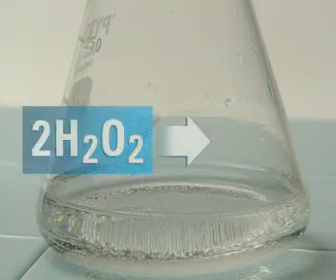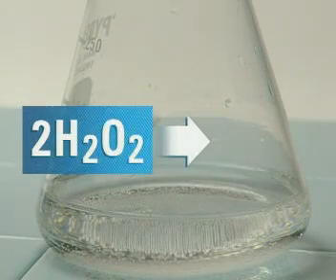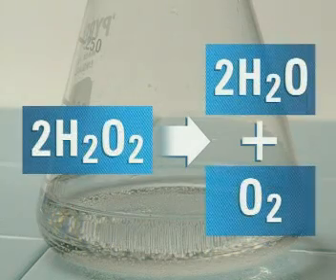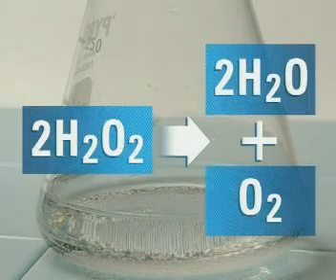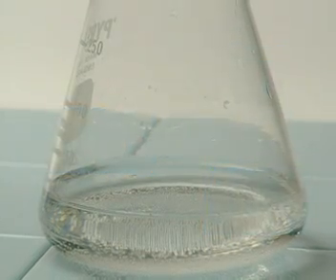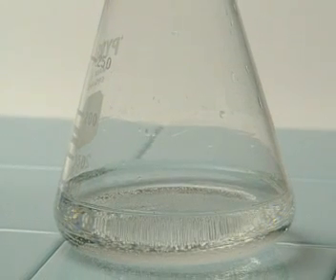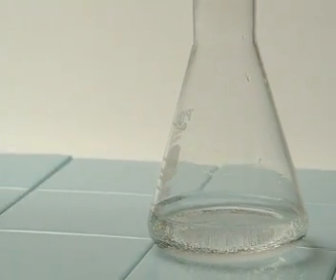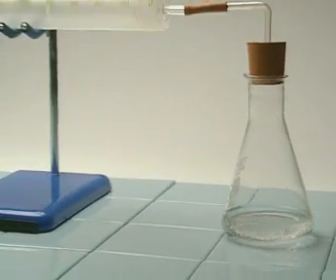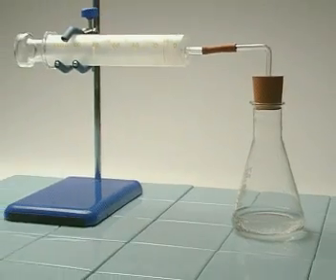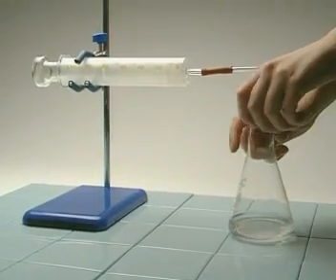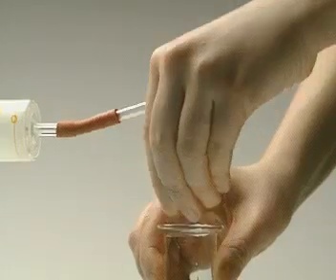This is hydrogen peroxide. It slowly decomposes to form water and oxygen. Any oxygen produced will be collected in the syringe, but at room temperature the reaction is so slow you'd think nothing was happening.